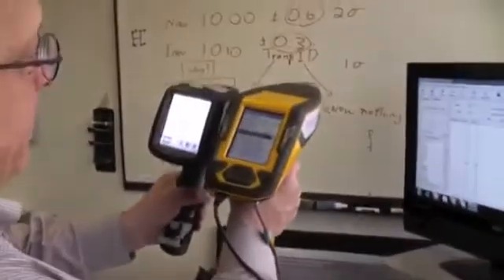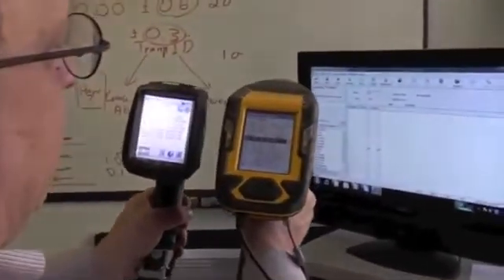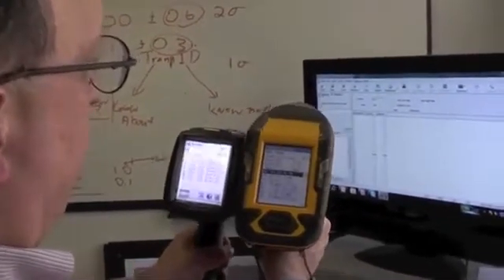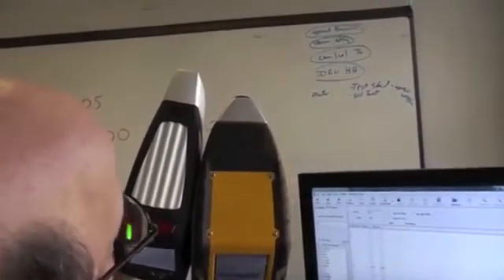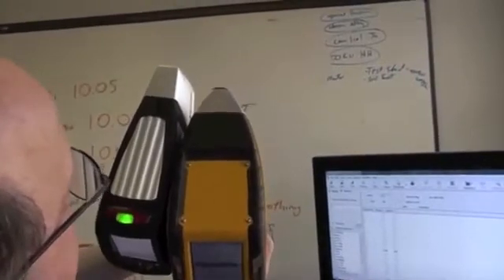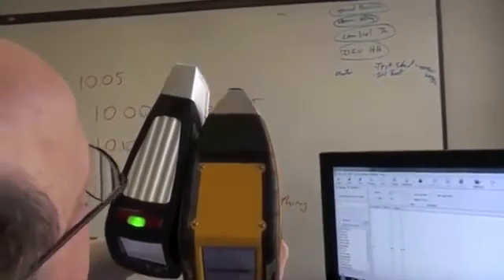The size is quite a lot bigger. When you look at this thing, it's twice as wide, 50% wider that way. You can see from the top that ours is a little bit longer, but definitely much wider and the shape is quite a bit stuffier.